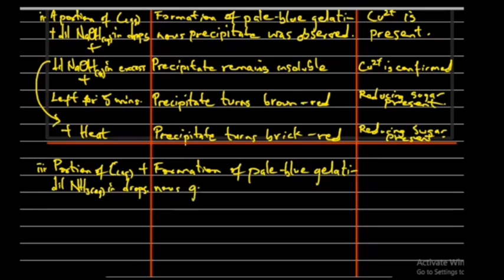So that also tells us that Cu2+ is present.